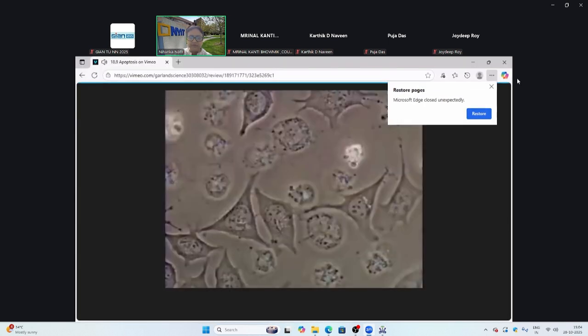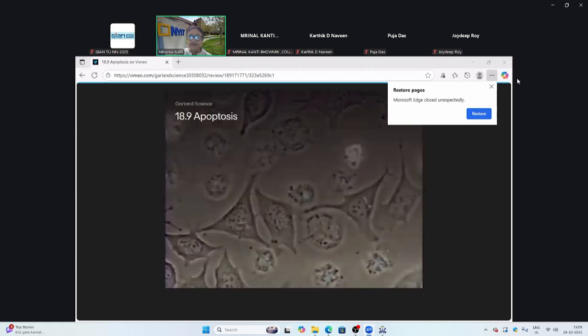Let me take you to the last video, which is the TUNEL assay video. This is for cell death.